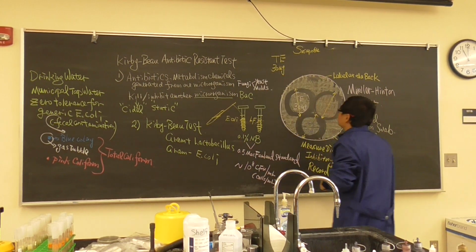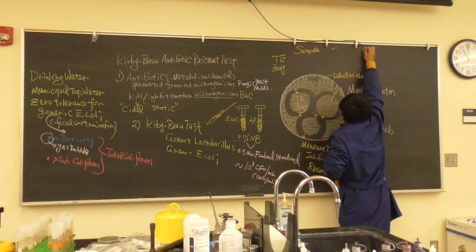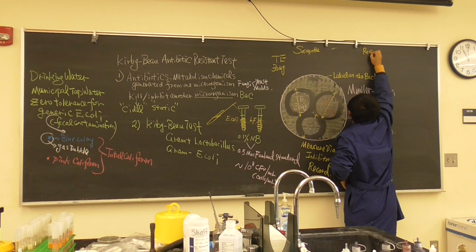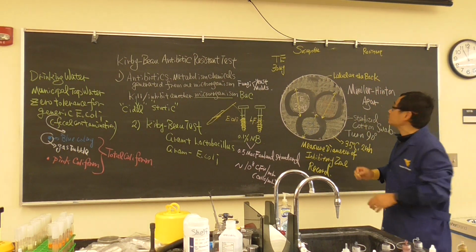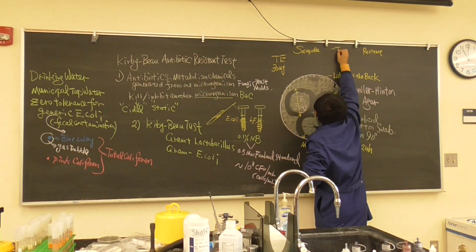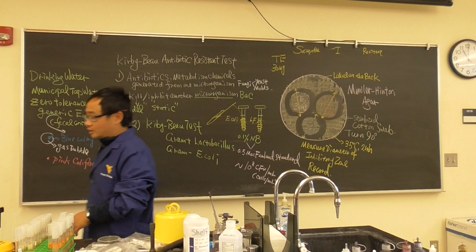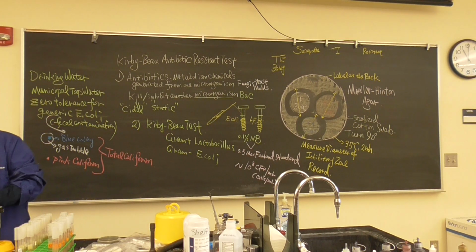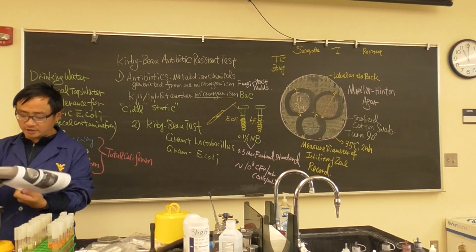Okay, now we know if some of them are susceptible, of course we have resistant, which means the antibiotic doesn't have much effect. And between those is intermediate. So let's compare the table. On the last page of your fact sheets, we have a table for that.